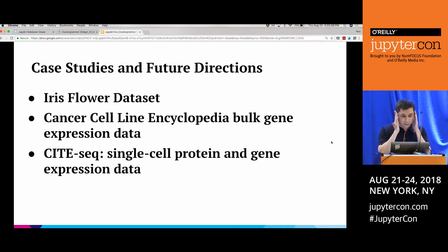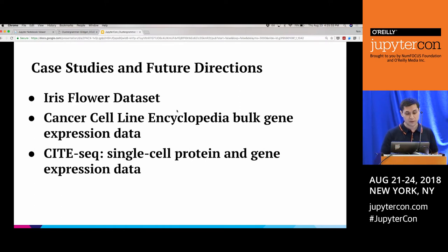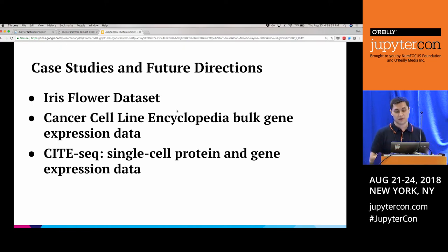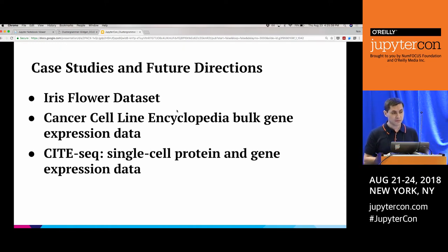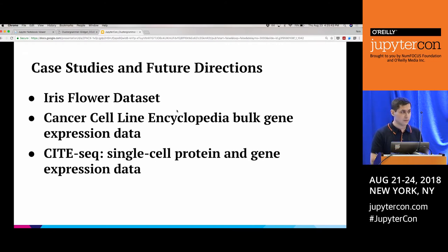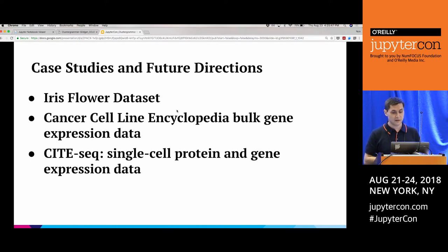Now we'll move on to some case studies to get into the details of working with real data and discuss the future directions of the project. We'll start with the Iris flower data set, then move on to the Cancer Cell Line Encyclopedia bulk gene expression data — a public data set produced by the Broad Institute — and finally some unpublished single-cell protein and gene expression data from an assay called CITEseq.